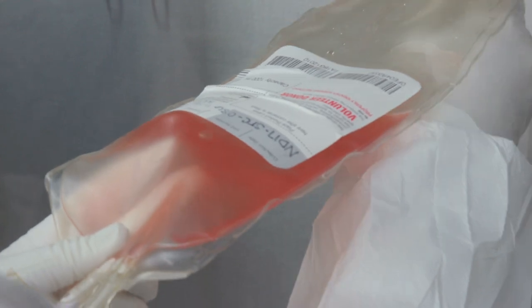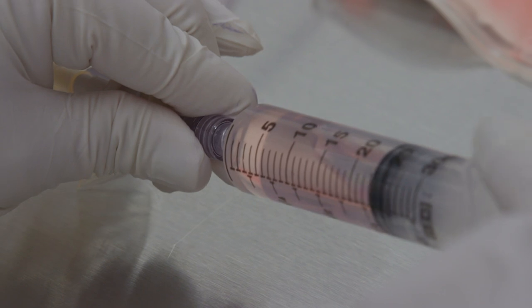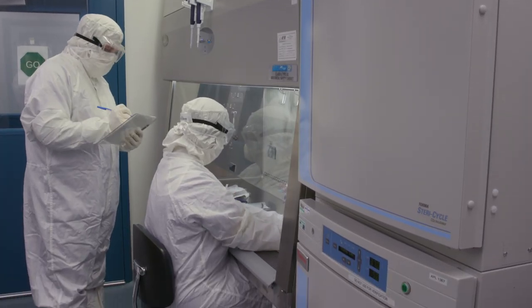Here in a high-tech space kept cleaner than most hospital operating rooms, scientists combine re-engineered human cells with carefully modified viruses to deliver bold new gene therapies to patients.